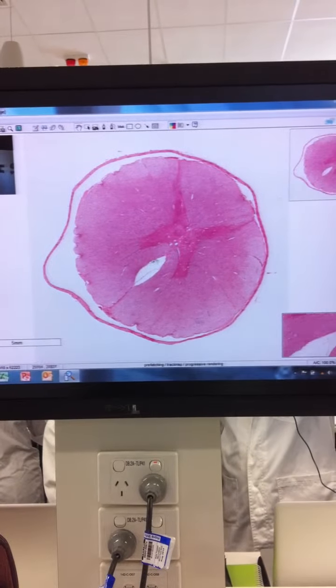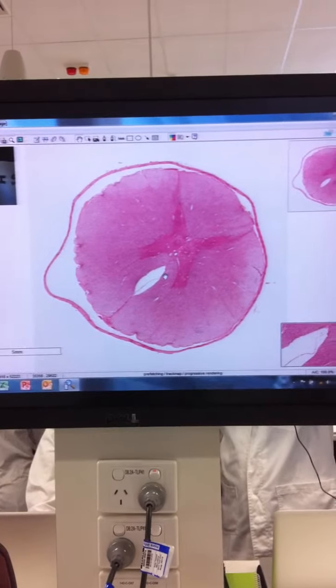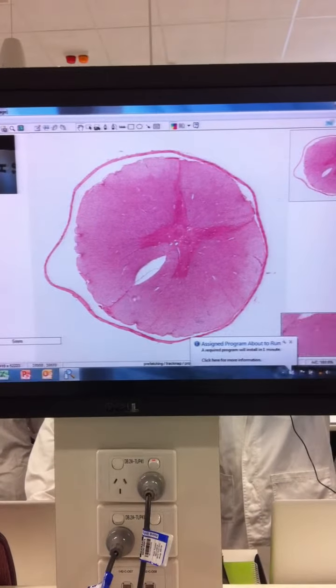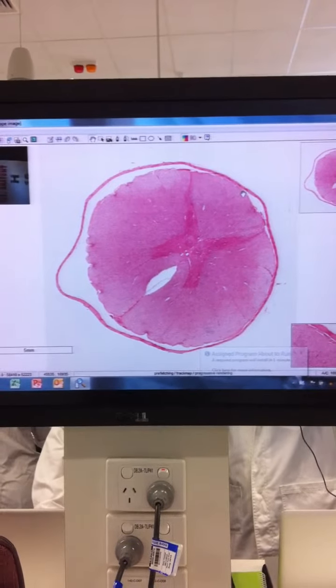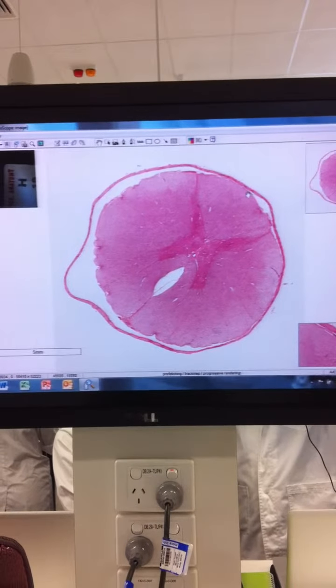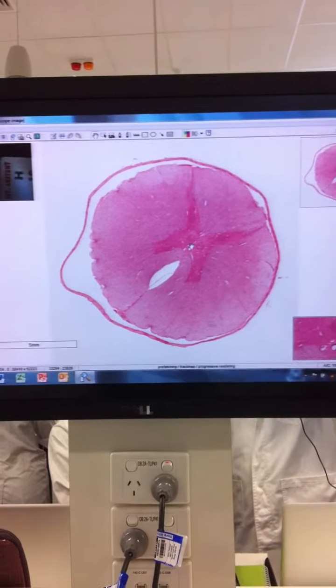And then we've got, this is artifactual here, so that big hole there is an artifact. It's not there normally. But we've got the ventral median fissure and the dorsal median sulcus, which we'll look at in a second, are part of the normal architecture. We'll need to see them higher apart. And right in the middle here we'll have a central canal.